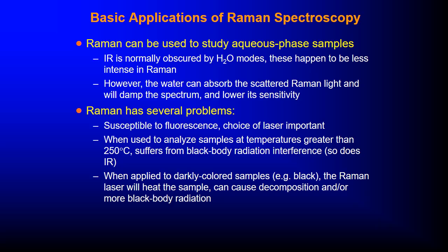Raman is susceptible to fluorescence, so it is very important that you do a thorough check. If you want to choose the laser, be very careful.